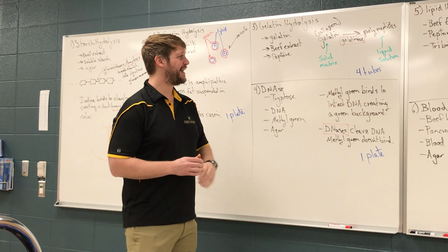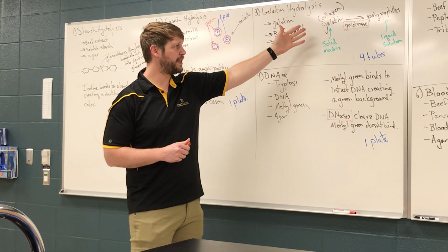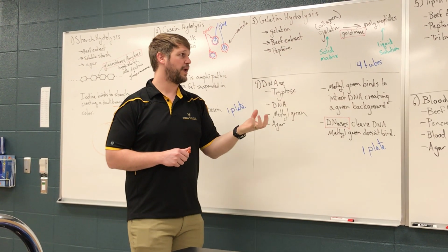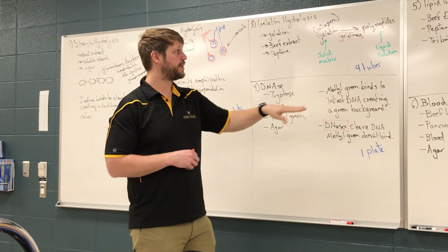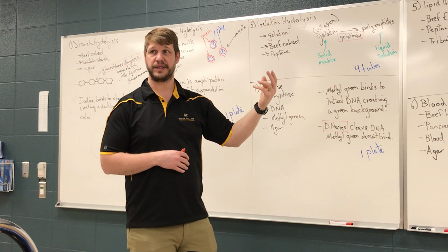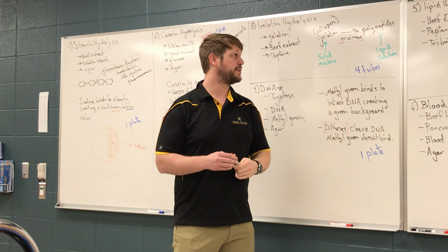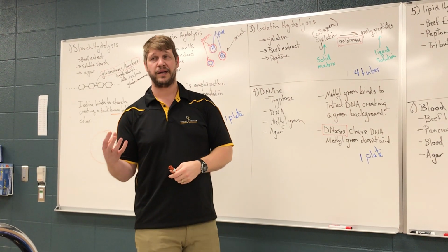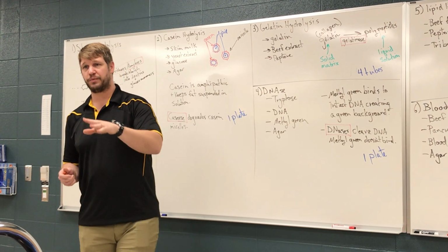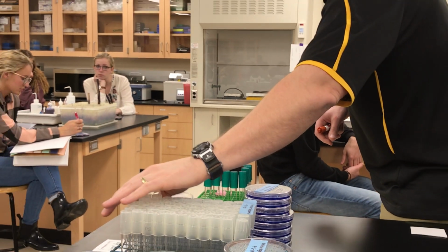Anyway, when you make Jell-O with gelatin, it forms this solid matrix. Certain organisms will have gelatinases, enzymes that can degrade the gelatin. If they do, it's going to break that gelatin down into smaller polypeptides, and you'll basically end up with a liquefied solution. And so these are poured as a tube, right?